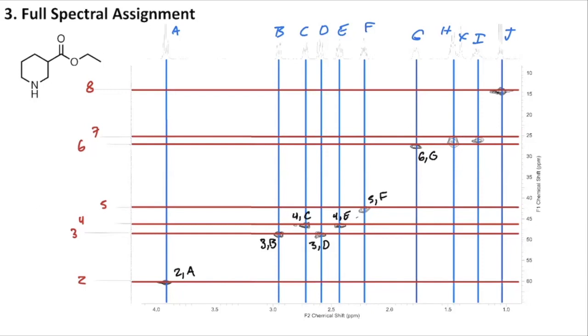So let's say that this is a 6H and a 7H correlation peak. 7 also seems to kind of correspond to I. Again, the line isn't perfect there, so I'm not certain about that. Let's put a little asterisk to remember to come back to that, since it doesn't seem as nice as we might want it to be. It looks like 8 corresponds with J.